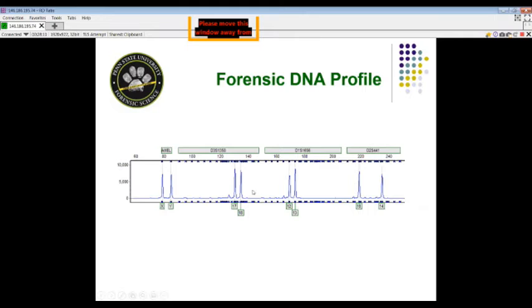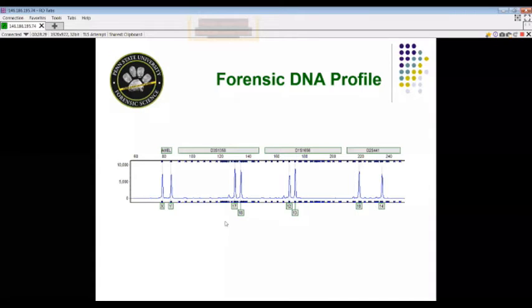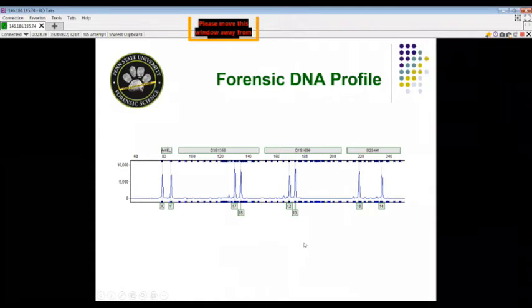And then I move down to the next position here, and there are two more peaks. When we think about these peaks, we're looking at the numbers 17 and 18. The reason these peaks are separated by size is that they have repeated regions of DNA that repeat a certain number of times. In this case, there are 17 repeats, and then 18 repeats. At the next location across the genome, we have 12 repeats and 13 repeats. So the DNA profile is simply 17, 18 and 12, 13. Relatively simple to decode the DNA profile.